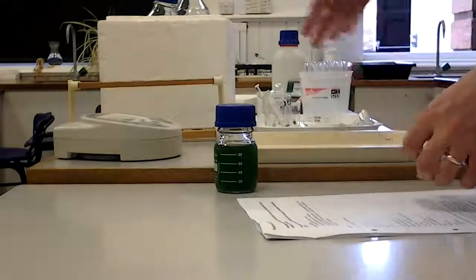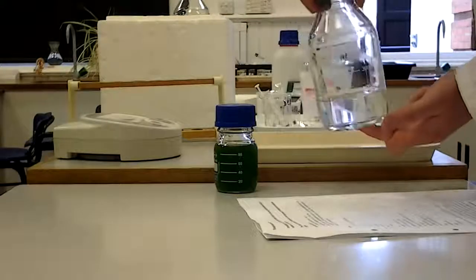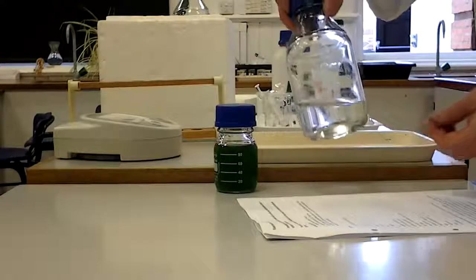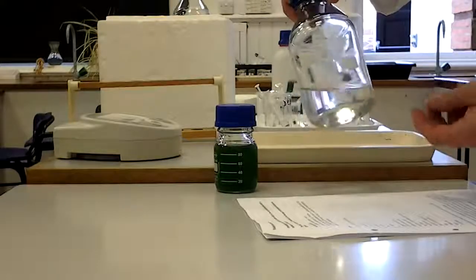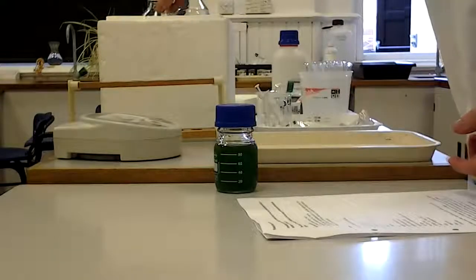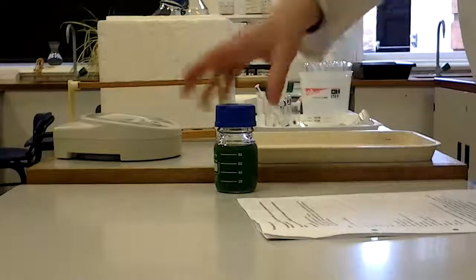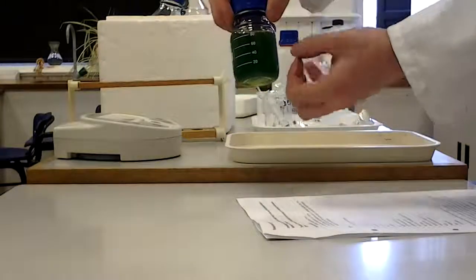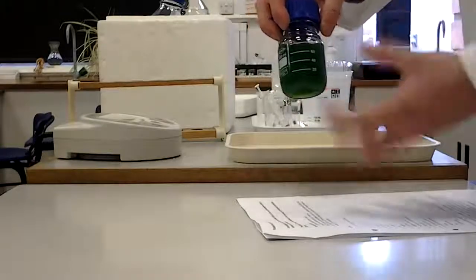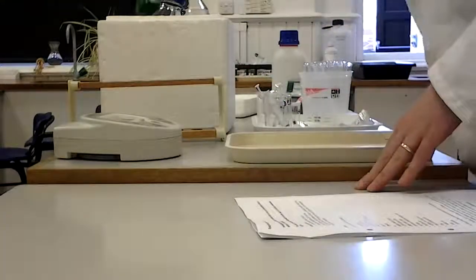You will be mixing the spinach leaves with something called an isolation buffer. This is a liquid solution designed to protect the chloroplasts when they are released from the cells. It's isotonic with chloroplasts so there will be no osmotic shrinking or bursting, and it's also cold. All of these things are kept on ice when we are not using them, to protect them from enzyme action that might damage them. I'm going to put those back in the ice bath for the time being.